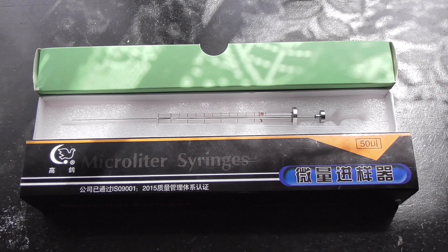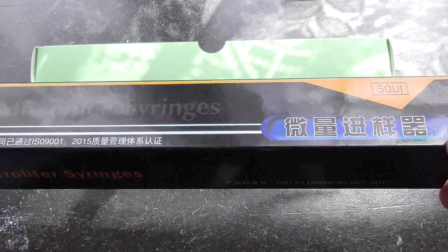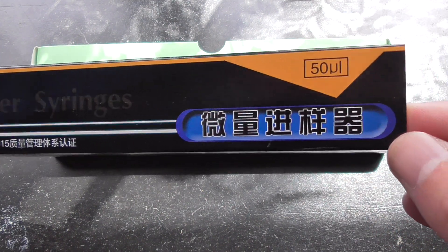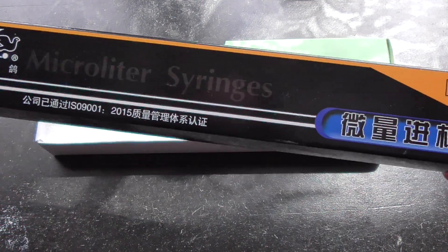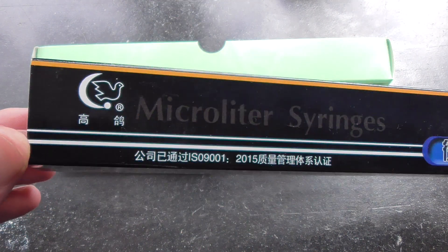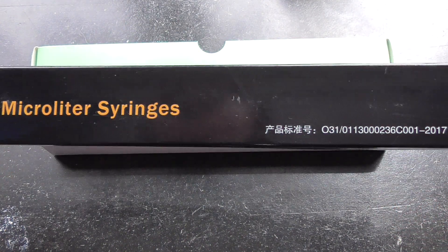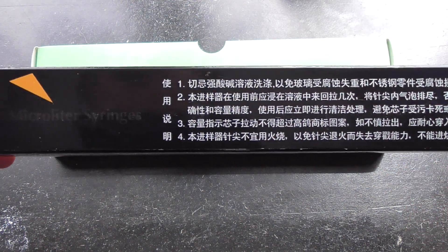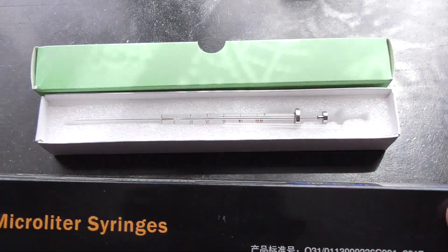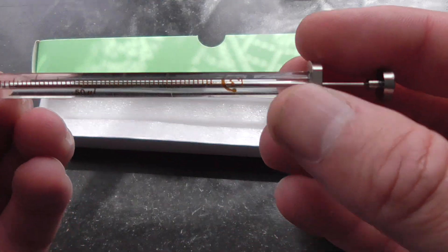By the way, if you are interested in the syringes, this is the manufacturing company. Unfortunately I can't read or speak Chinese, but perhaps if you see a picture somewhere you'll be able to identify it. This bird for example should be a hint. It covers 5 to 50 microliters — some instructions probably. It's pretty neat, easy to use and very accurate.